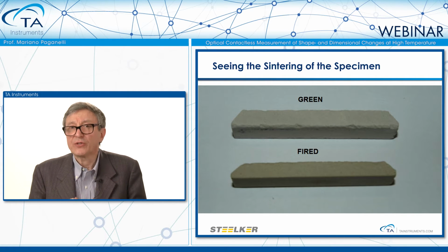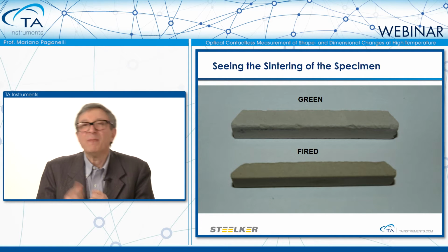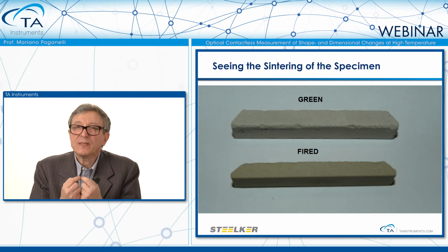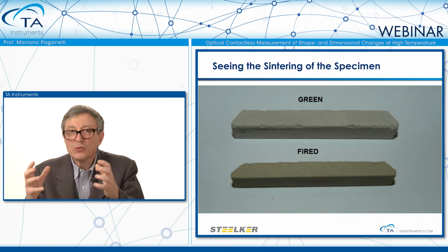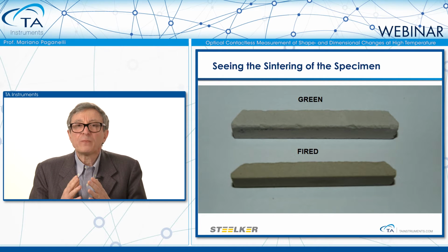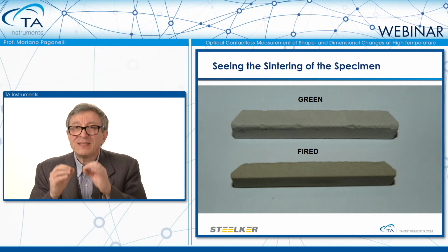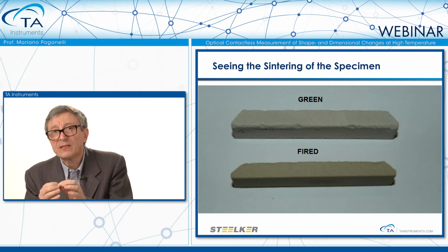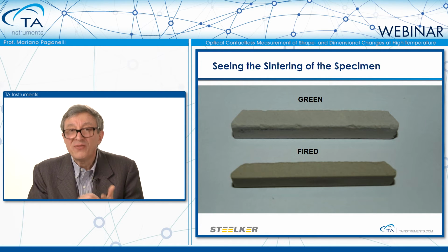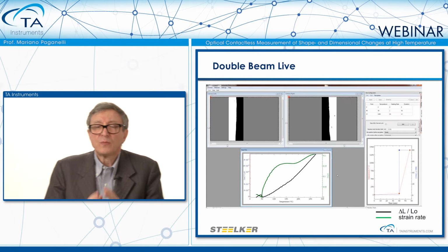In many fields of research, the scientist is not interested in the melting, indeed. He is interested in the early development of the glassy phase, which is promoting the sintering. All traditional ceramic is like that. Then, it is of utmost interest to find the temperature at which the sintering rate or strain rate reaches the maximum, in order to design the fastest possible heat treatment.